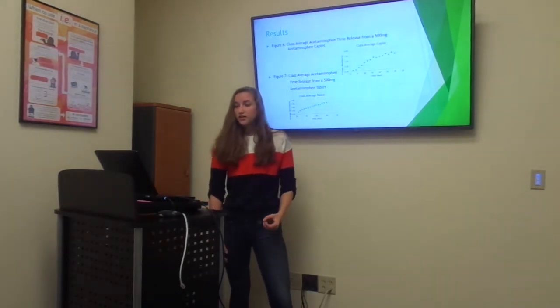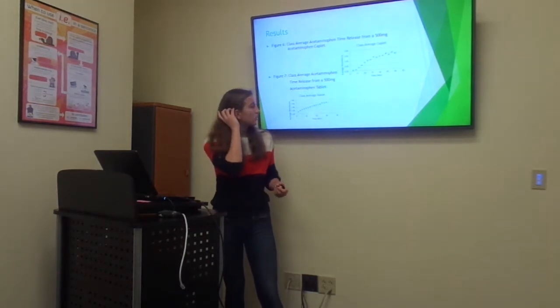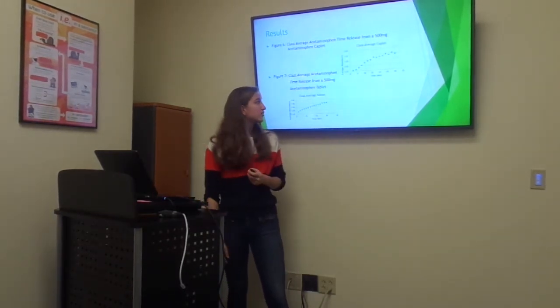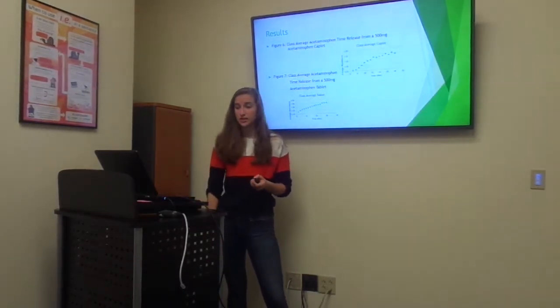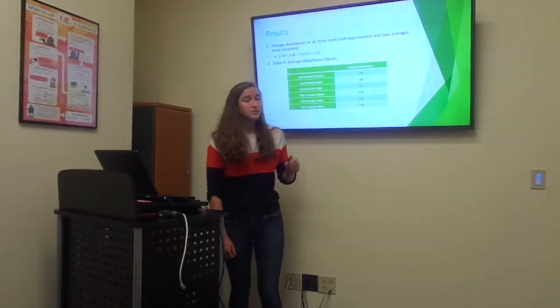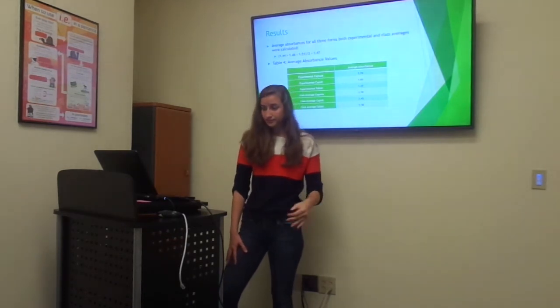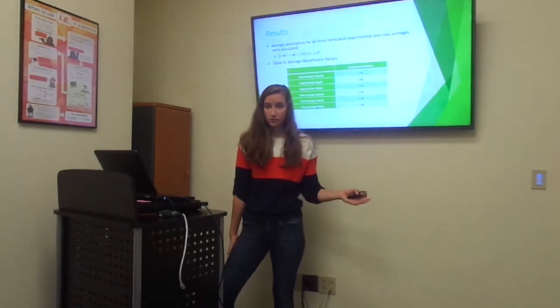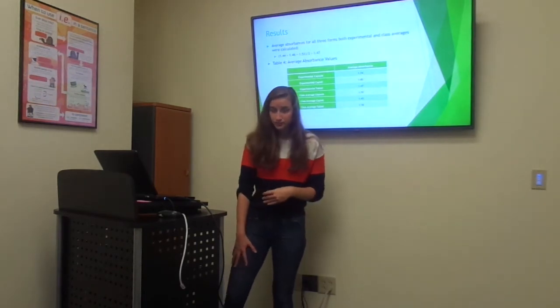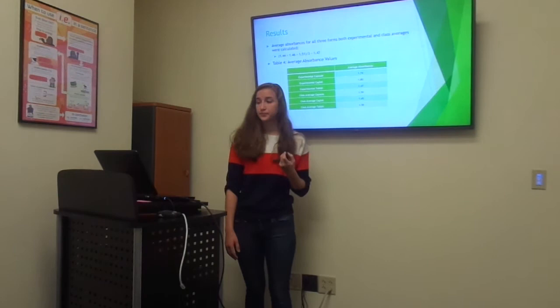In figure 6, for the caplet, the last 4 data points were used as a leveling off point, and for the class average of the tablet, the last 3 data points were used. So as explained before, the leveling off points were then averaged to find the average absorption for all 3 forms, both class average and experimental. These are shown in table 4.